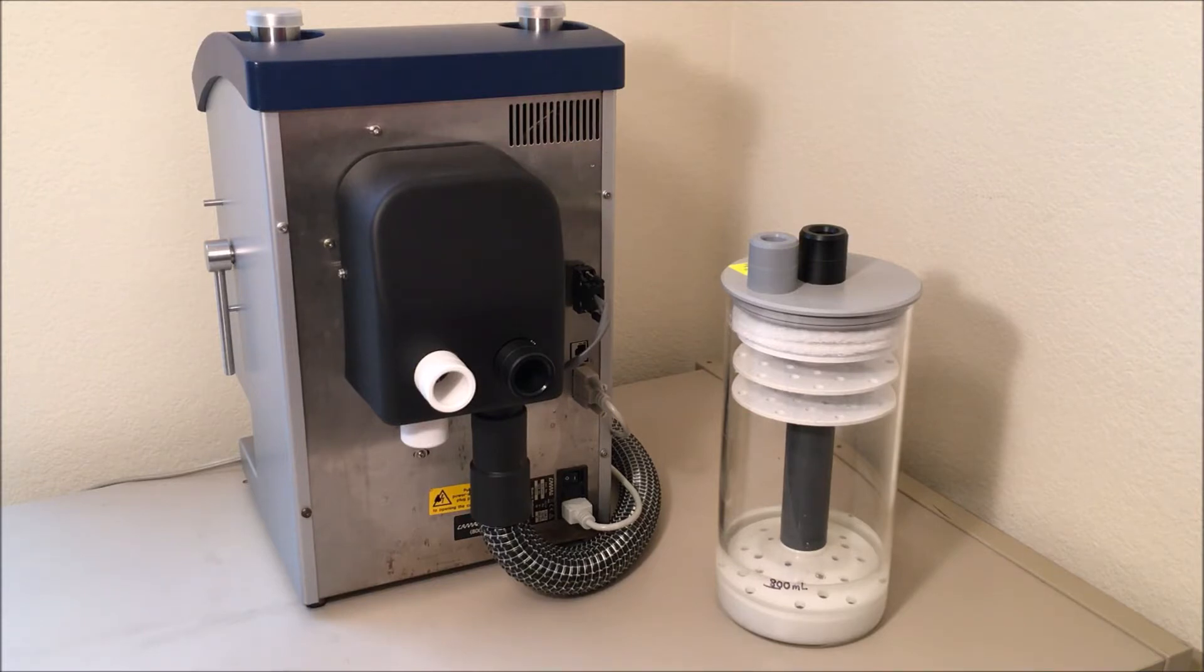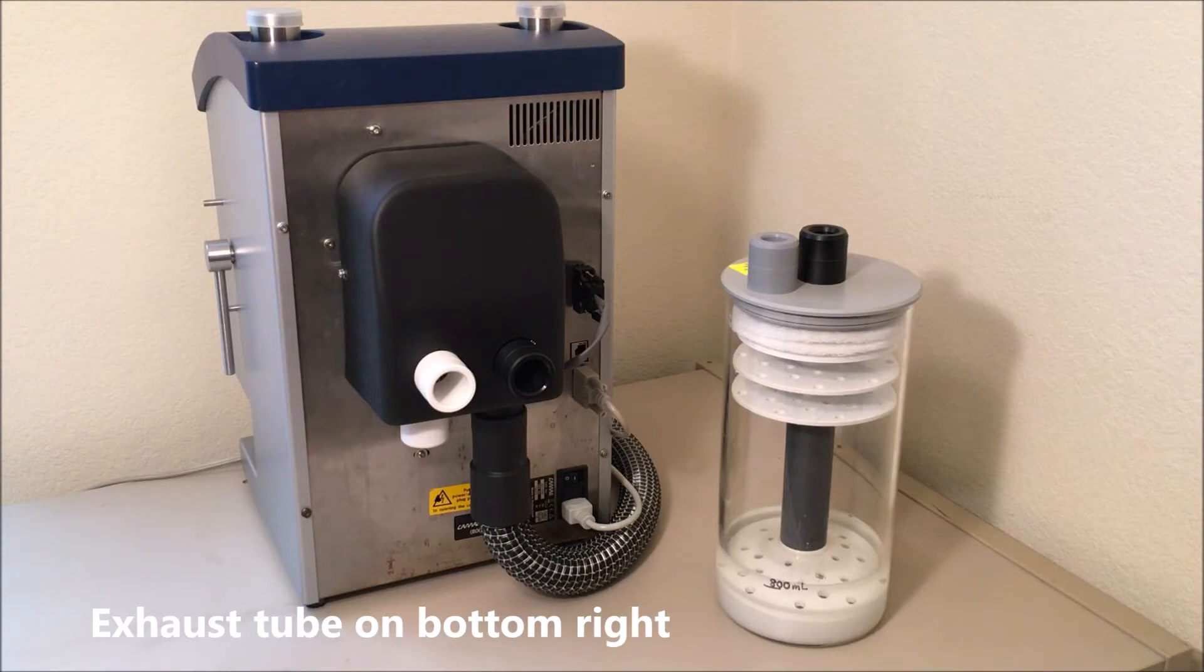First of all, as you can see I have the back of the ADC tube facing us and the tube that is coming down from the humidity control module is actually the exhaust tube. So it goes on the right side on the bottom.